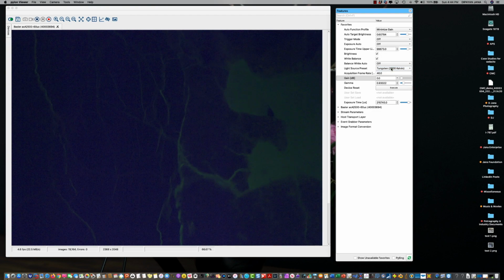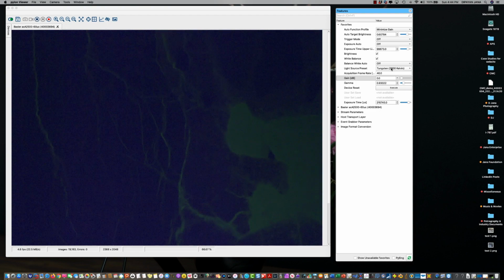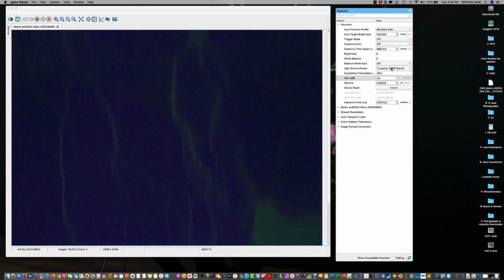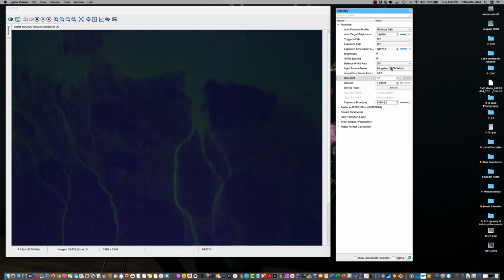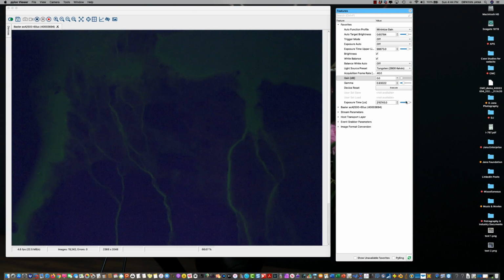And there is no fluorescent light mode in the industrial application like you have in the microscopy camera, microscopy software. You have the fluorescent light mode, but in the industrial camera you can still highlight the cracks in the fluorescent light.